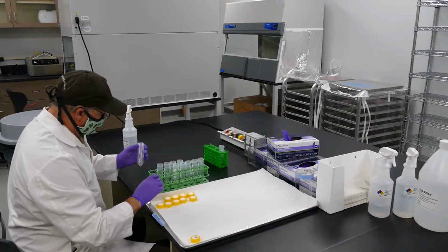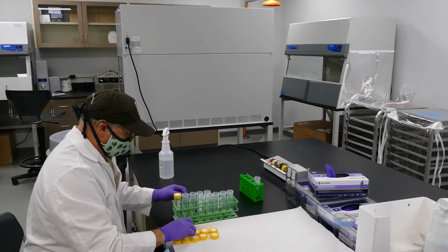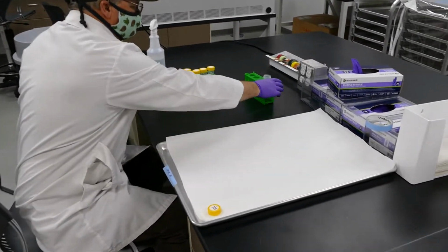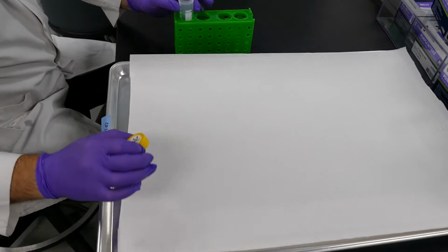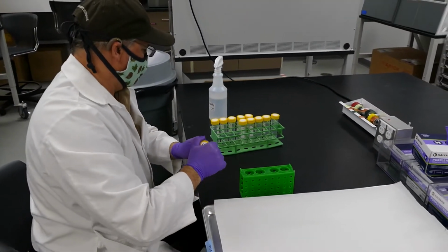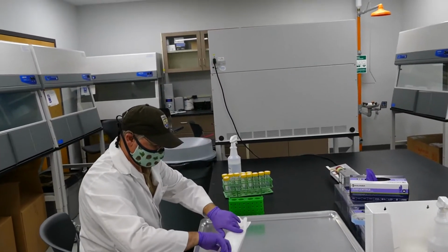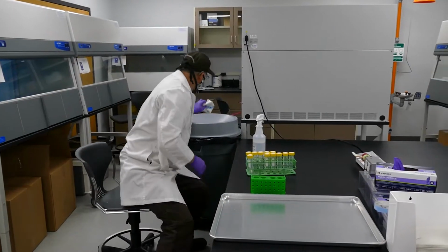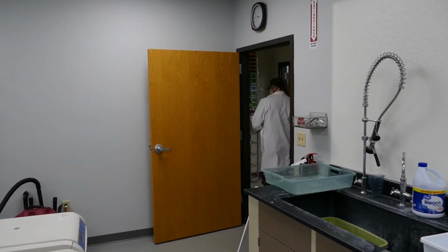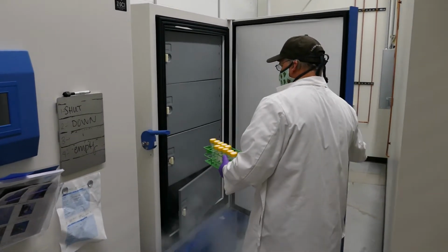You can then carefully match the caps with the corresponding tubes, making sure to secure the caps without cross-threading. After all tubes have had their caps replaced, you can dispose of any tray liners or other non-reusable items. Bring the sample tubes along with the hood control tubes to the -80 freezers.